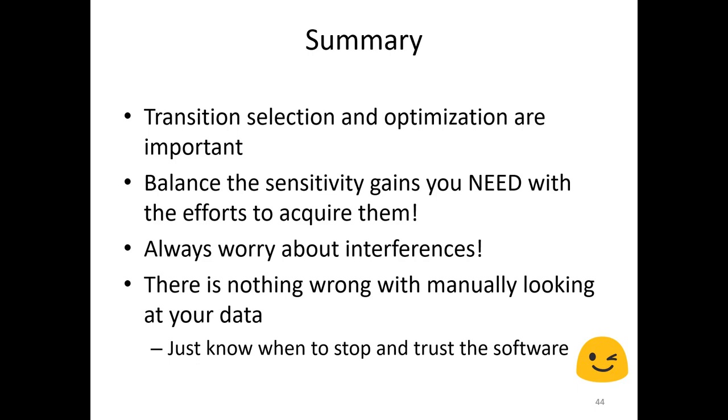Always worry about interferences, from the sample itself in a solvent matrix to looking at different biological samples, different donor samples. It's really important, because if you have an interference and are unaware, then the data are misinforming, and it's not quantitative or accurate.